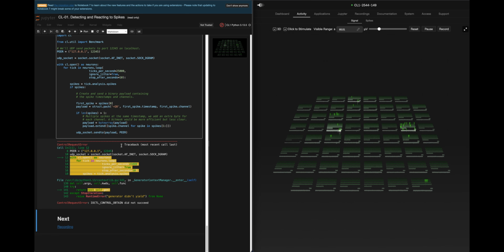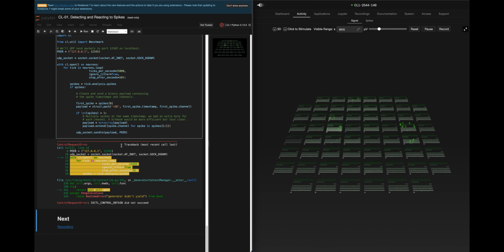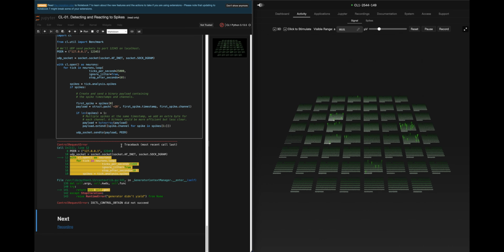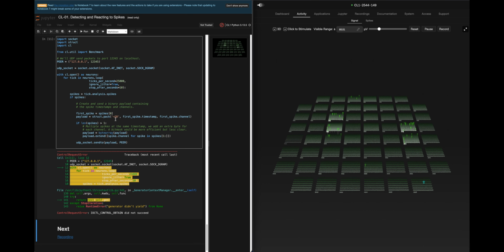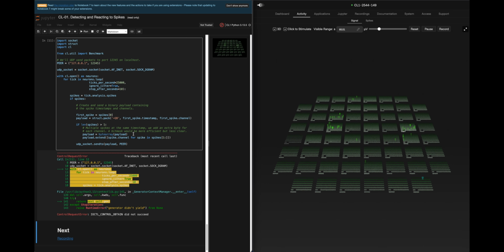I highly, highly recommend that anybody putting the investment into this hardware take the extra time and go through these tutorials. If you don't know how to code and you're relying on a coding agent, well, I thankfully came from years of Python coding. I was not the greatest JavaScript programmer, but this is all in Python. I am a fairly middle-of-the-road coder, and I'll admit that right now.